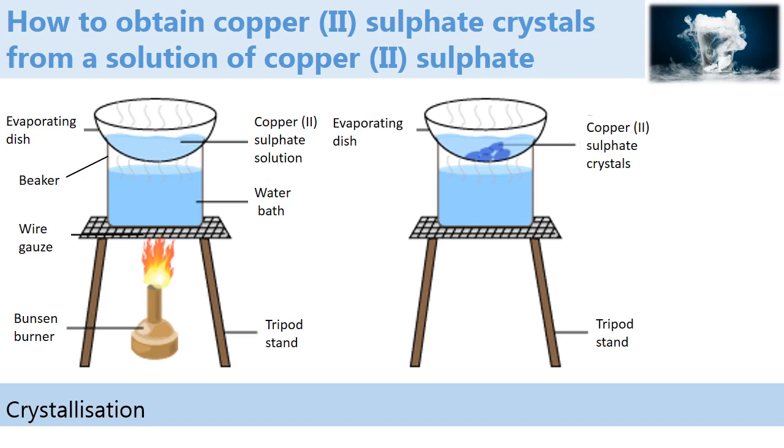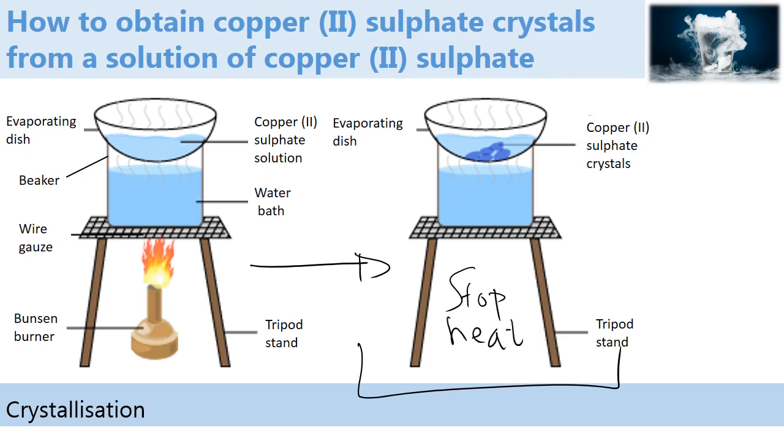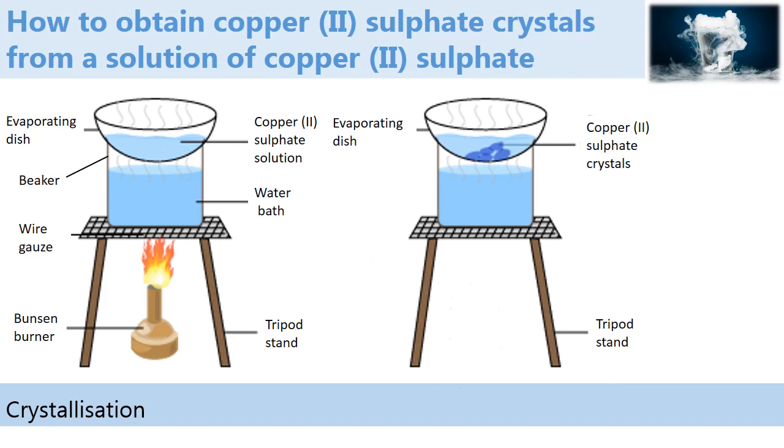After we reach saturation point, we shift to this next diagram and we stop heating, and allow the solution to cool.